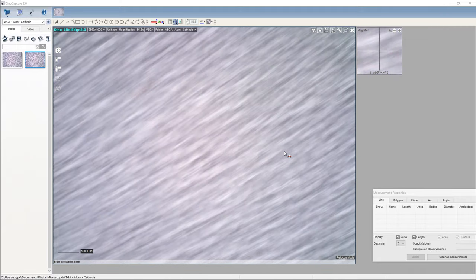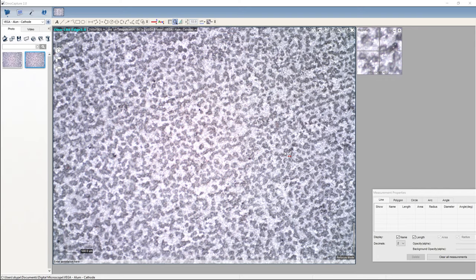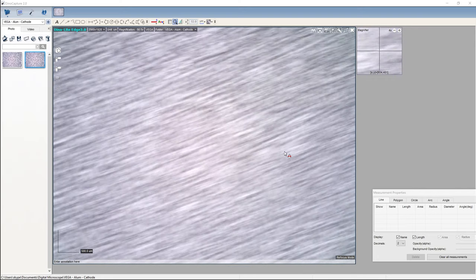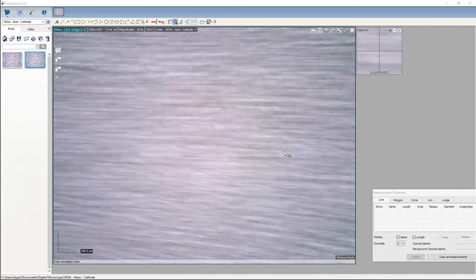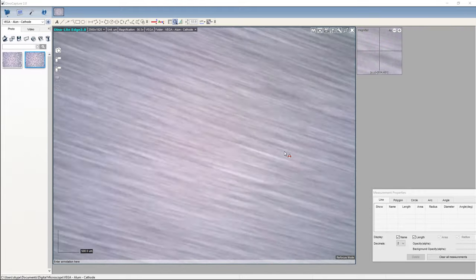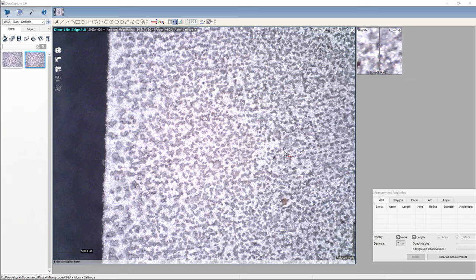I'm going to go left and right rather than up and down. Yeah, you can see they get smaller out towards the edge. And in the center again, we've got big, and then we're going to go the other way. And in theory, they should get smaller towards the edge, which they do. Okay, although there's some big ones on the edge.